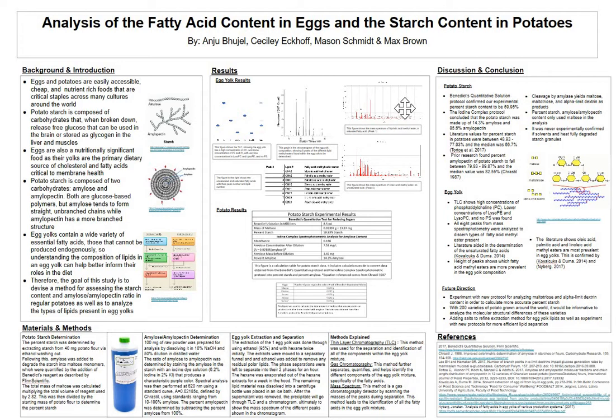So we used this method. It's a gas chromatography detector by scanning the masses of the peaks during separation, leading to the ultimate identification of the fatty acids. So when we're looking for those fatty acids, we took the largest peak. See, the top red peak is the saturated fatty acid, and the bottom one is the unsaturated fatty acid.